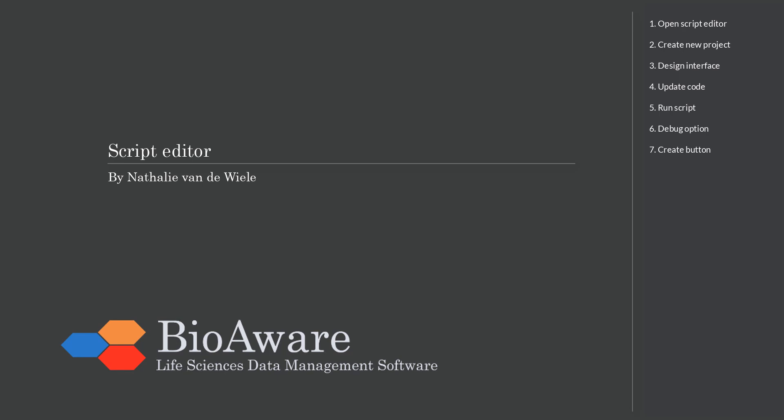Hello and welcome everyone. My name is Nathalie van der Wielen and in this movie we will show you how to use the Script Editor in Biolomics.